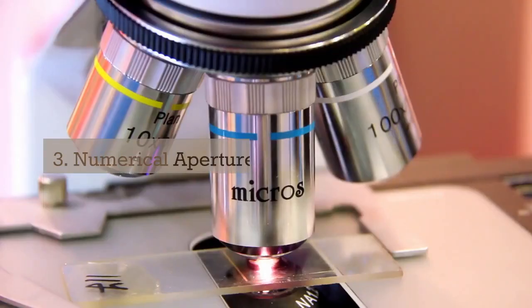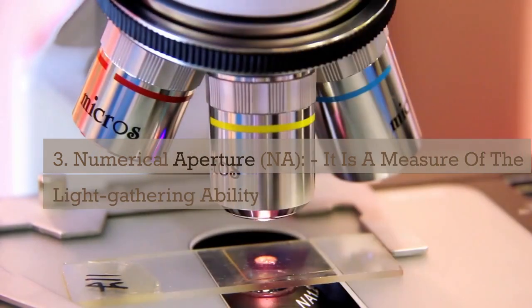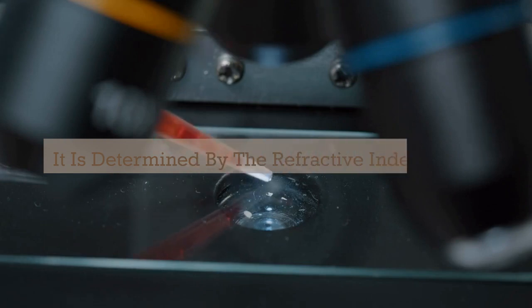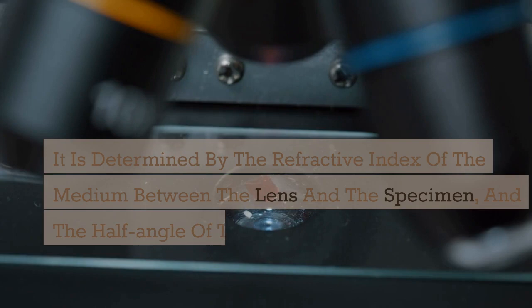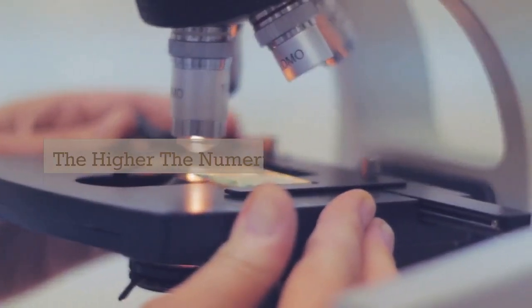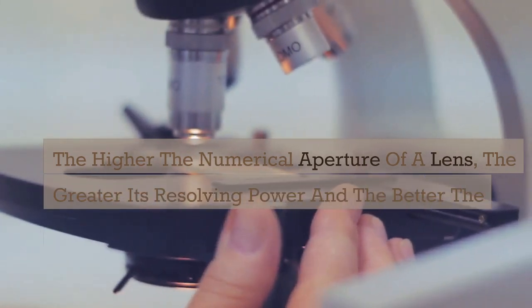3. Numerical aperture, NA. It is a measure of the light-gathering ability of a microscope's lens. It is determined by the refractive index of the medium between the lens and the specimen, and the half angle of the maximum cone of light that can enter the lens. The higher the numerical aperture of a lens, the greater its resolving power and the better the image quality that can be obtained.